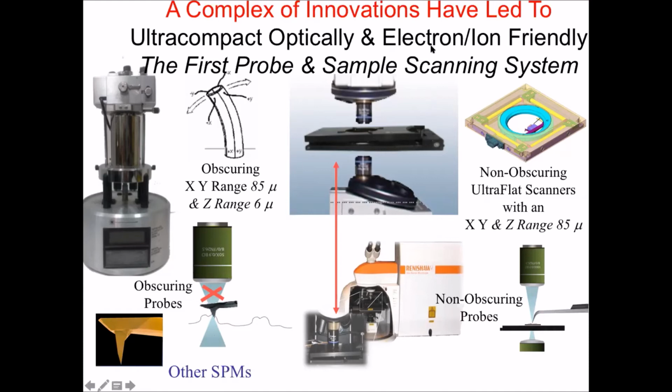Or if you wanted to put it in an electron ion beam machine, you couldn't do it, okay? Or if you wanted to put what would be a near-field microscope in a Raman microscope, you couldn't.